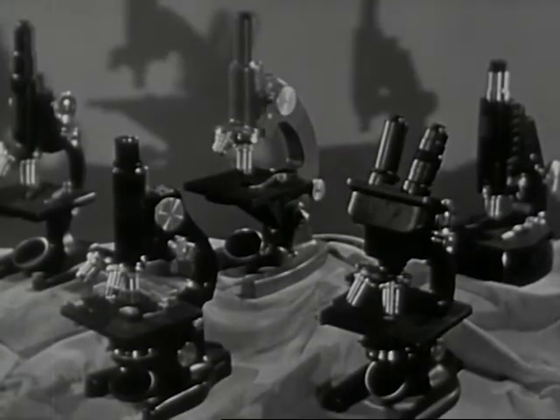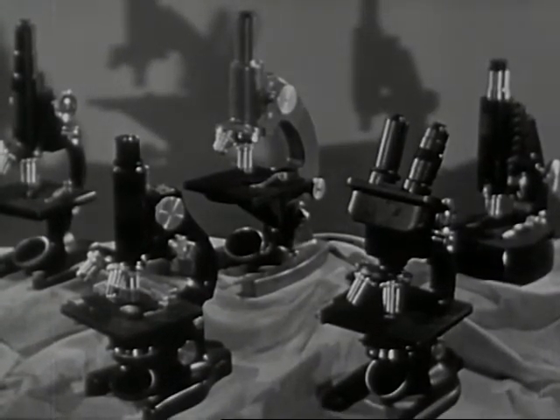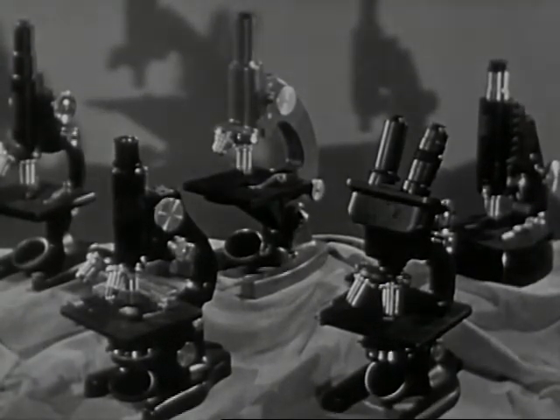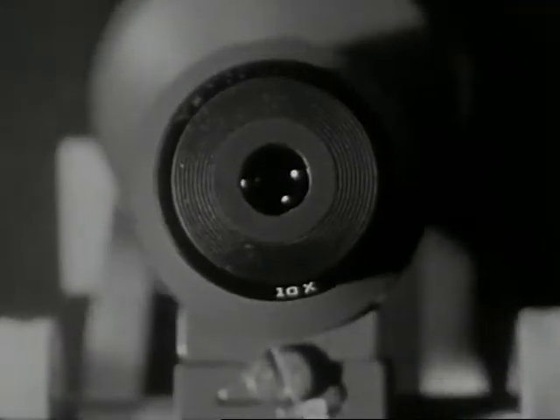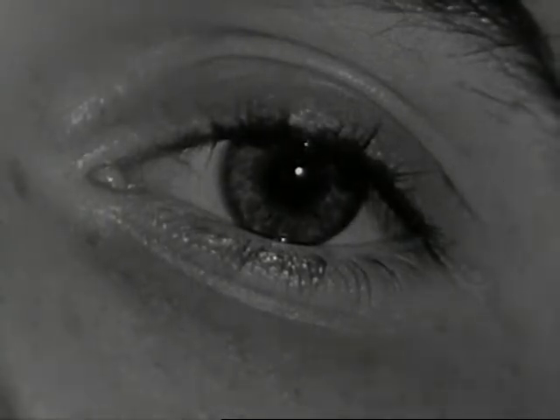There are many types of microscopes, some more elaborate than others, some made for special purposes. But essentially, they are all for the same purpose: to magnify plant and animal life and other matter of minute size to a degree that it may be seen and studied. The powerful eye of the microscope extends the range of your eye when you use it correctly.